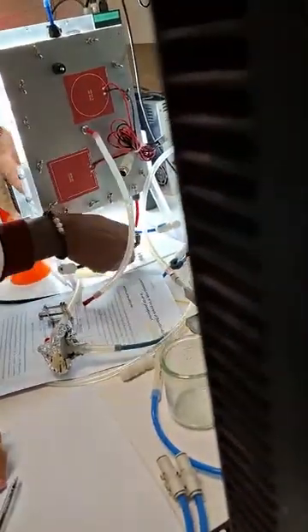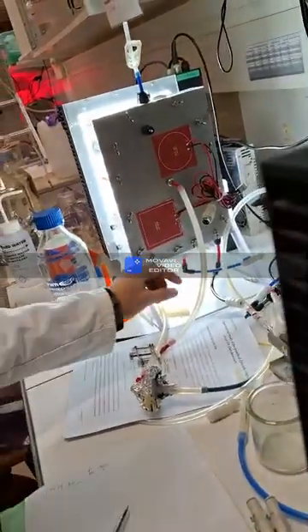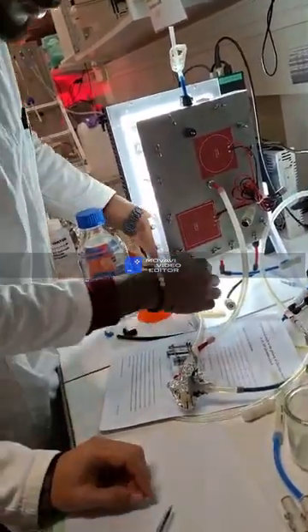You see? Is it okay for you? Now it is blocked. It means it will not pass. Exactly. And here I will do the same.